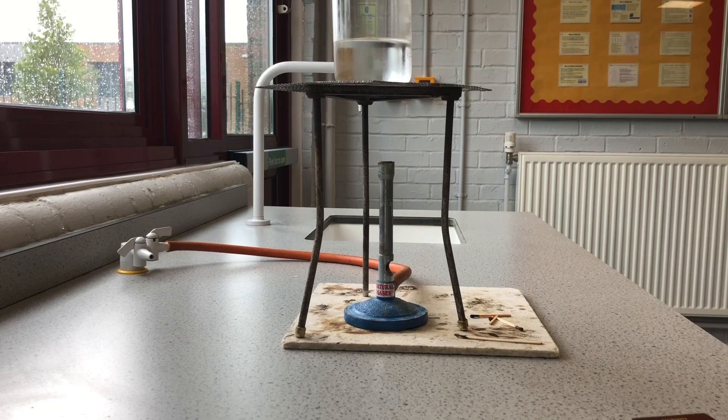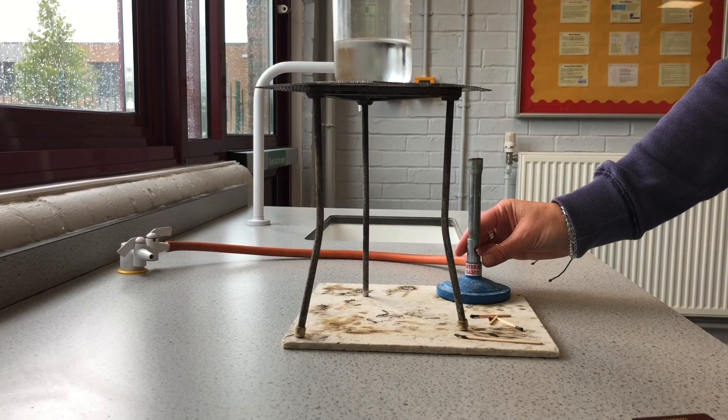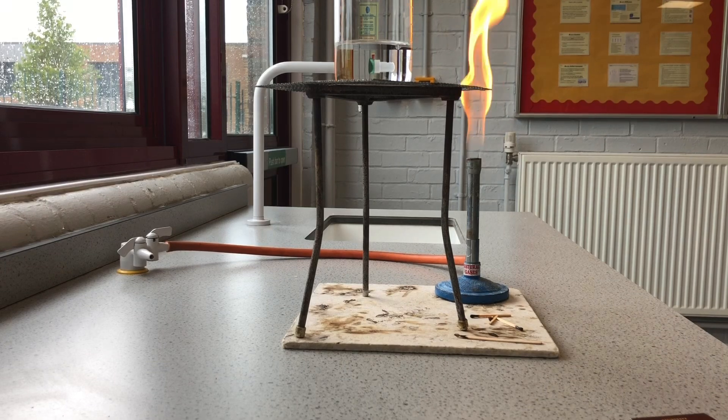Then we switch to safety flame when we come out. So if I've finished what I want to do, I take the Bunsen out and put it back on safety flame. If my teacher wants to talk to me, I can put it on safety flame and know that no one's going to get hurt, and I'm ready to have that conversation.